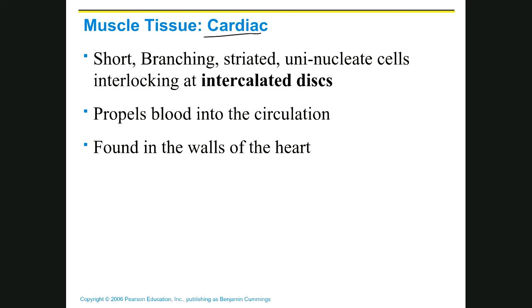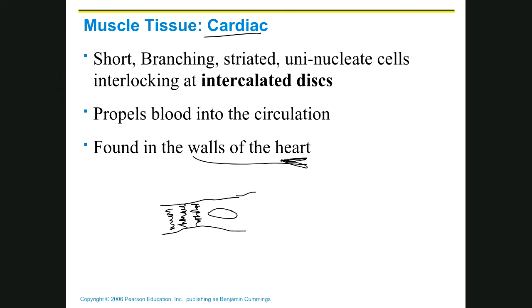Let's look at cardiac muscle. Cardiac muscle is only found in the heart — in the walls of the heart. When you look at it, it has some similarities to skeletal muscle because it's also striped and has striations. But that's where the commonalities end, because it's only got one nucleus, they're not cylinder-shaped, they're sort of branched cells, and they're not long — they're short.